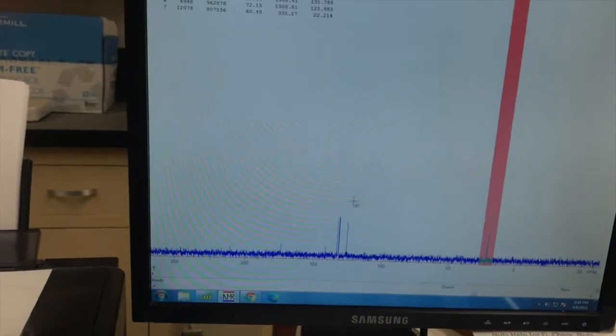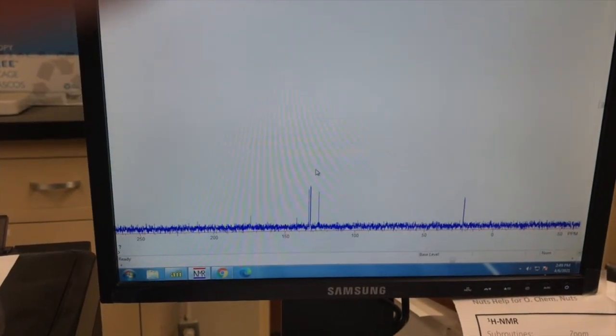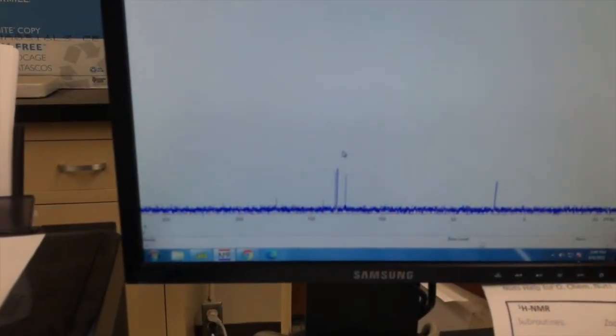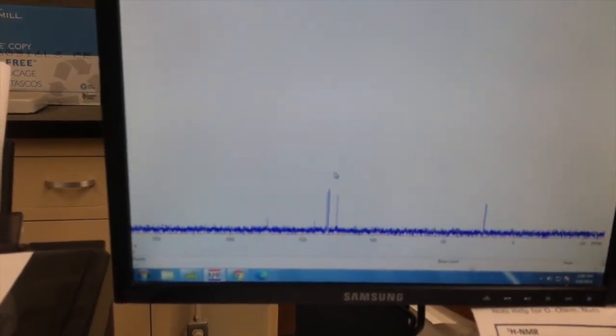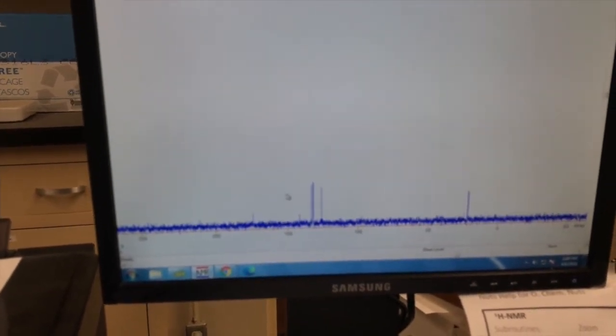I'm going to print this up. I'm going to save it, but then I'm going to eject this NMR tube, pour it into that same test tube that I was evaporating the solvent from before, evaporate some more, and then add a little deuterated DMSO to get it even. I'm going to get it to the point where it's insoluble. There's a lot of undissolved solid in there. Add a couple drops of deuterated DMSO, get it nice and concentrated, and then we'll get all the carbon signals, is my prediction.